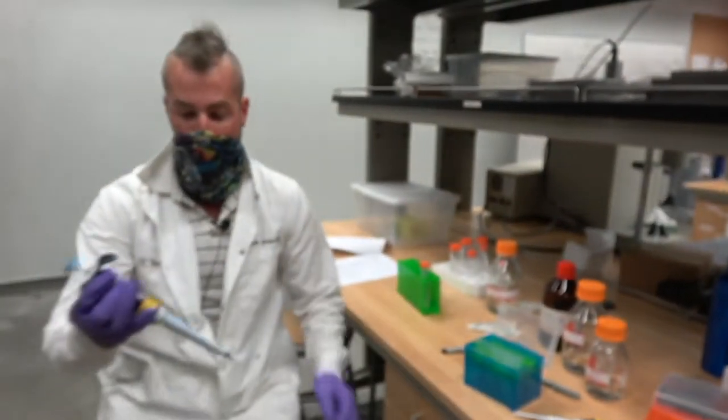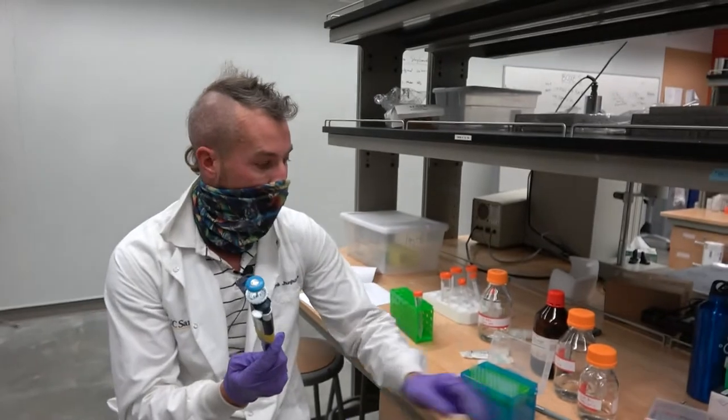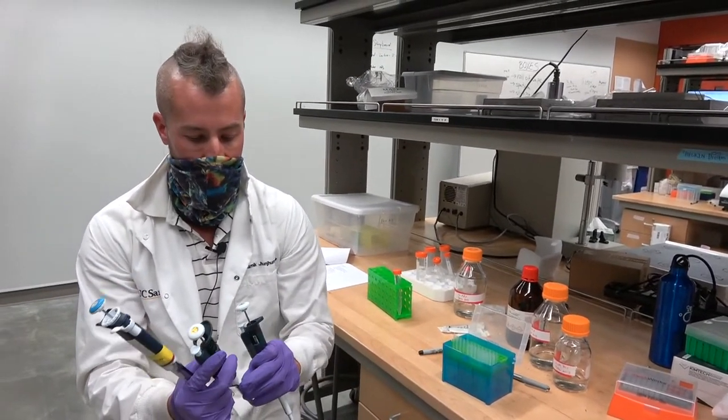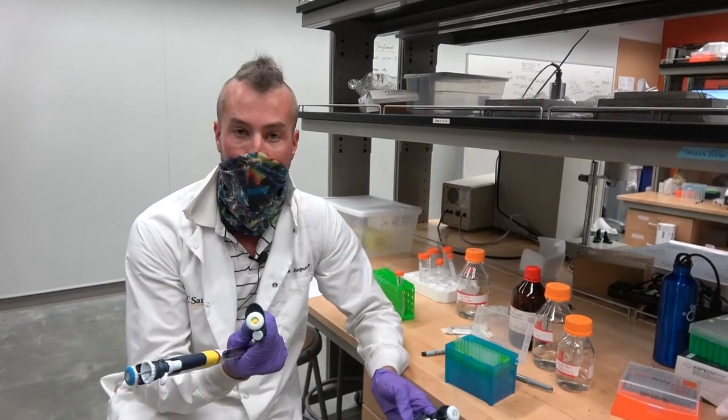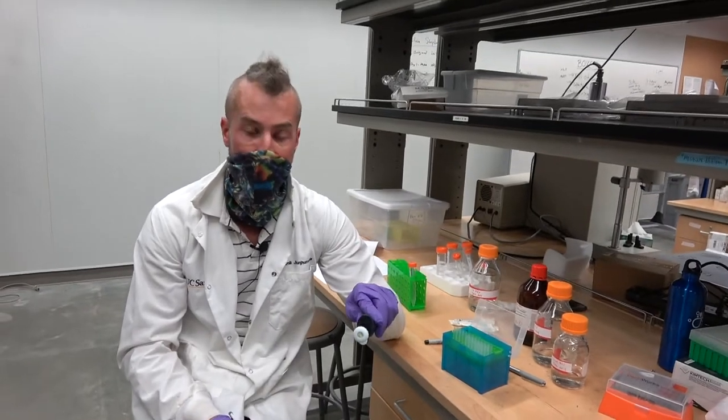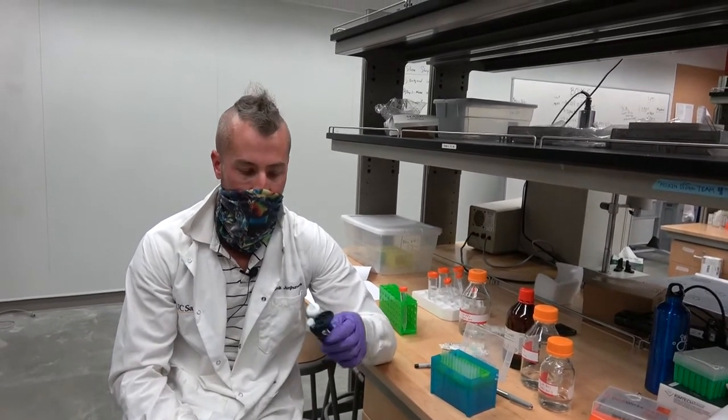There are all different sizes of pipettes. This one is a P200, so it can go up to 200 microliters. This one's a P20, for two to 20 microliters.